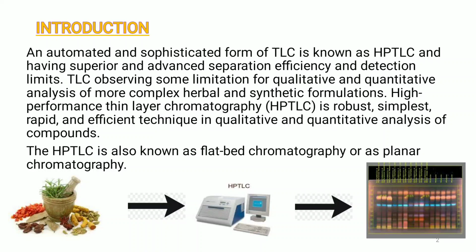A number of upgradations were made in the basic TLC method and it was automated to increase resolution between two components and for more accurate quantitative measurements. Automation is also helpful to overcome the uncertainty in droplet size and position when the sample is applied. The spot capacity can also be increased by developing the plate by two-dimensional chromatography.